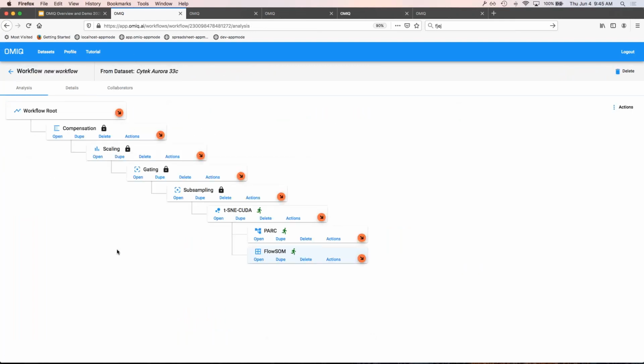And we can see that we're now processing a lot of stuff at the same time here. So we'll see if anything completes before I switch to my already completed workflow. And you can see that t-SNE is already done in 17 seconds, right? So that's displaying that speed.